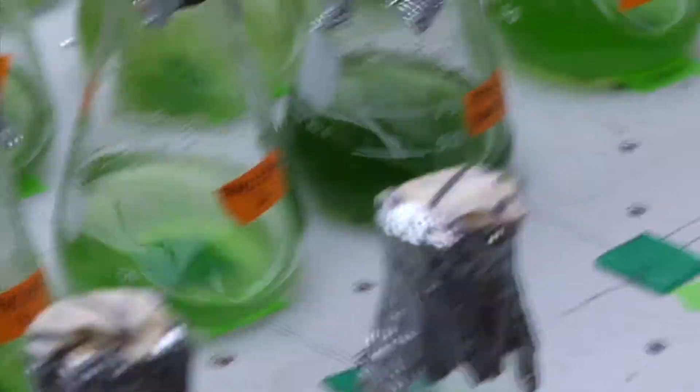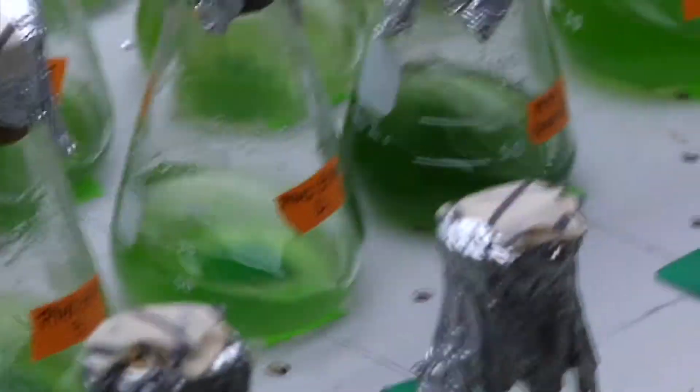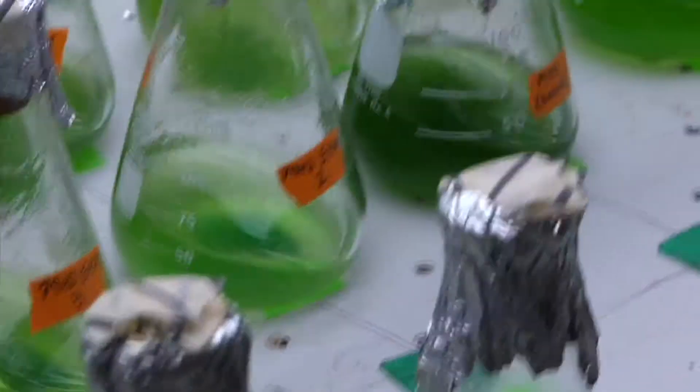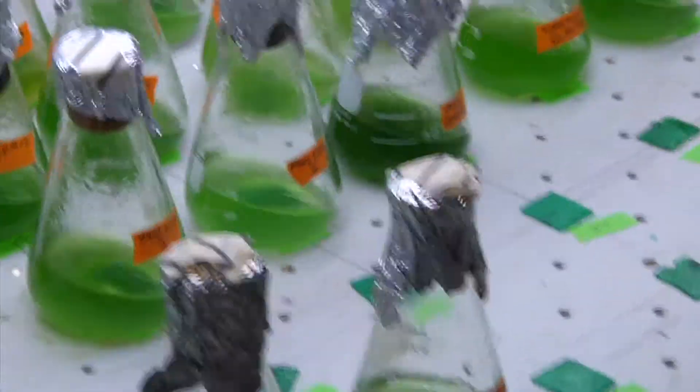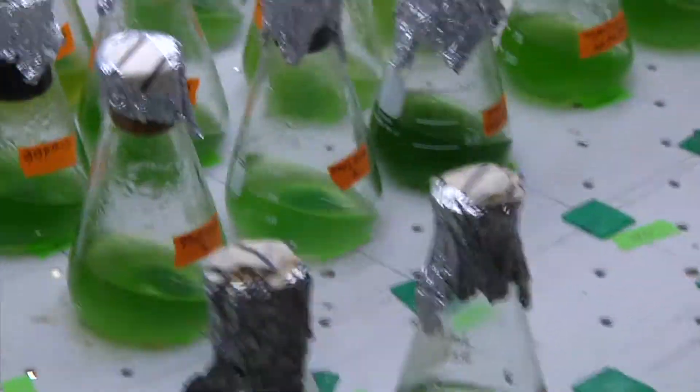Now if you took this prototype concept and expanded it, how big would that tank be? This swirling approach works great for these small flasks, these small volumes. If the volume gets too much bigger, swirling doesn't work so well. You start having gas exchange issues, so if you get really big, the format needs to change.